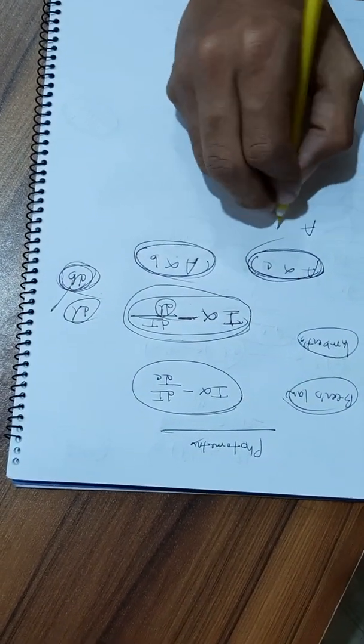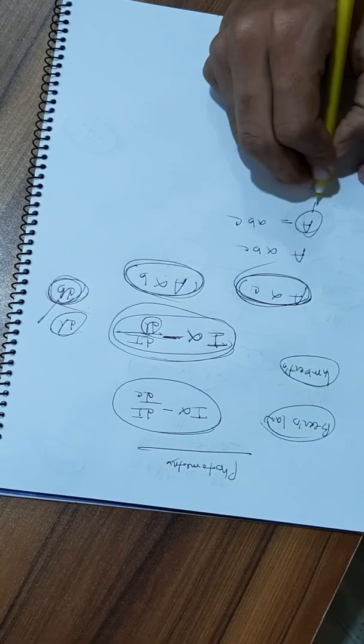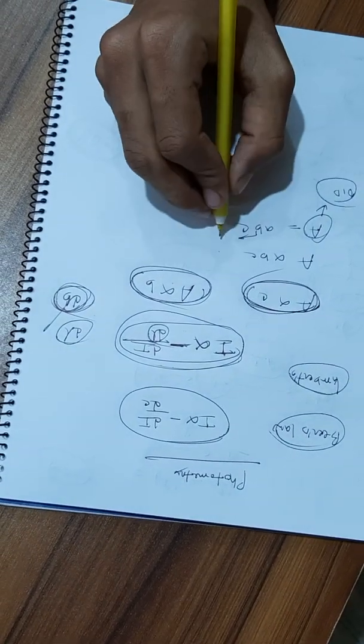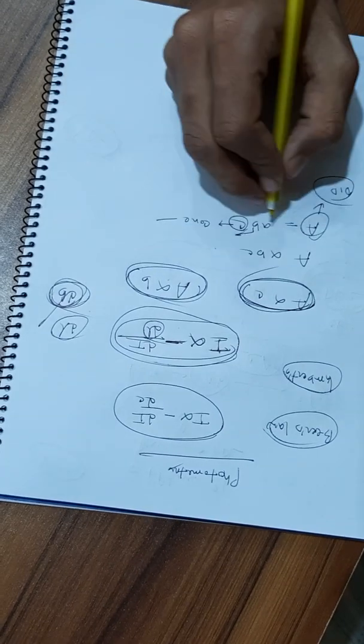From this we can say A is proportional to BC, A is equal to εBC. Here A is absorbance or optical density, B is the thickness or light pathway length, and C is the concentration of the solution.